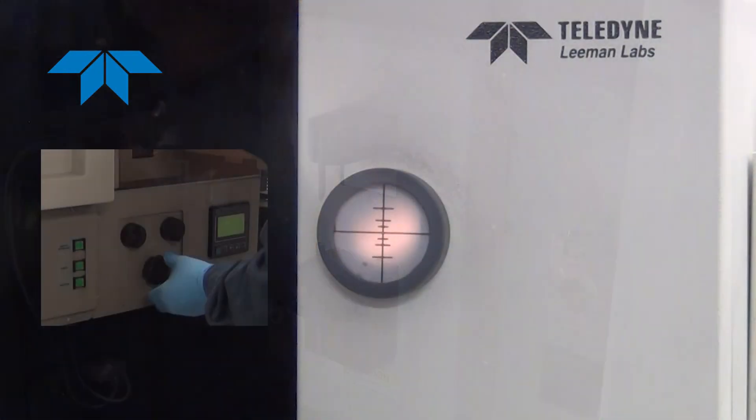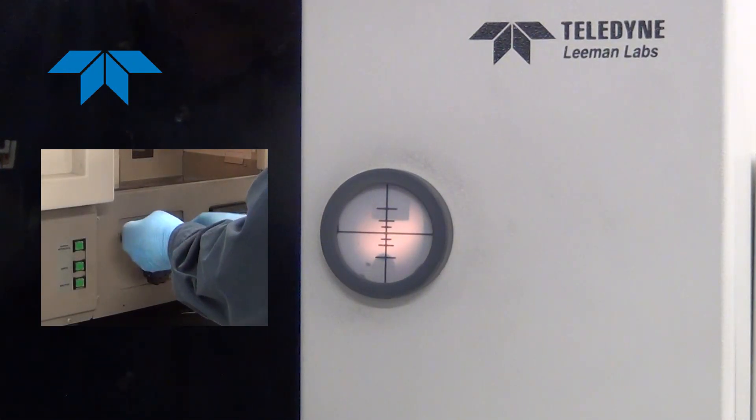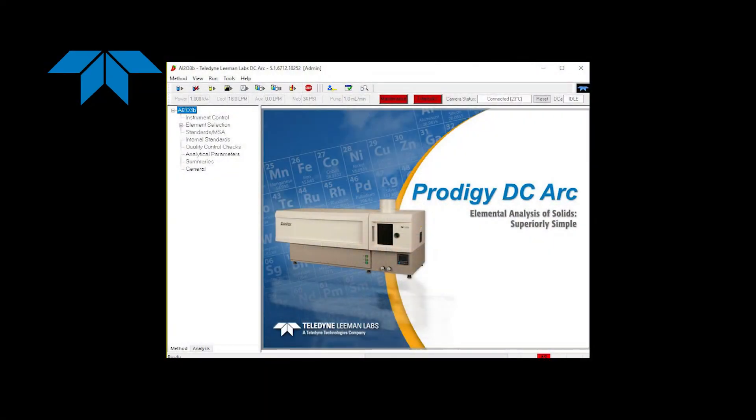When both electrodes are in place, the electrode gap is set using the two upper knobs. The electrode gap size is determined by the sample type and is typically 2 to 4 millimeters. Once both electrodes are in place, the sample is ready to run.